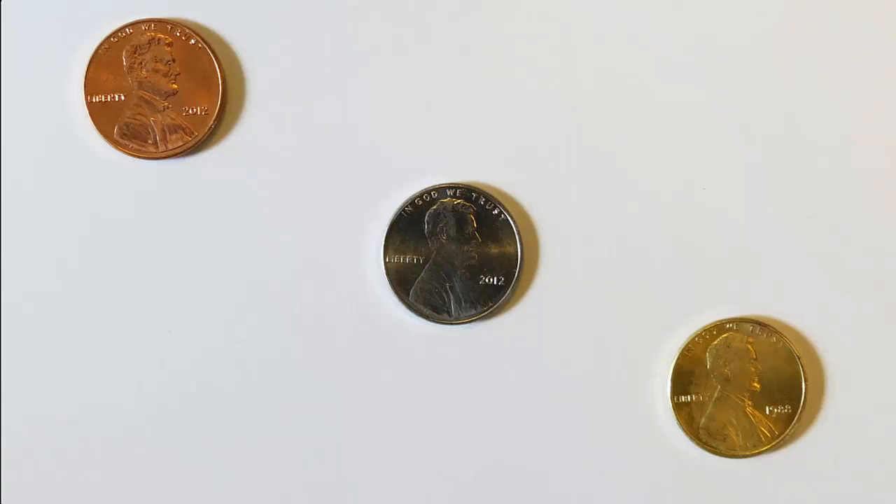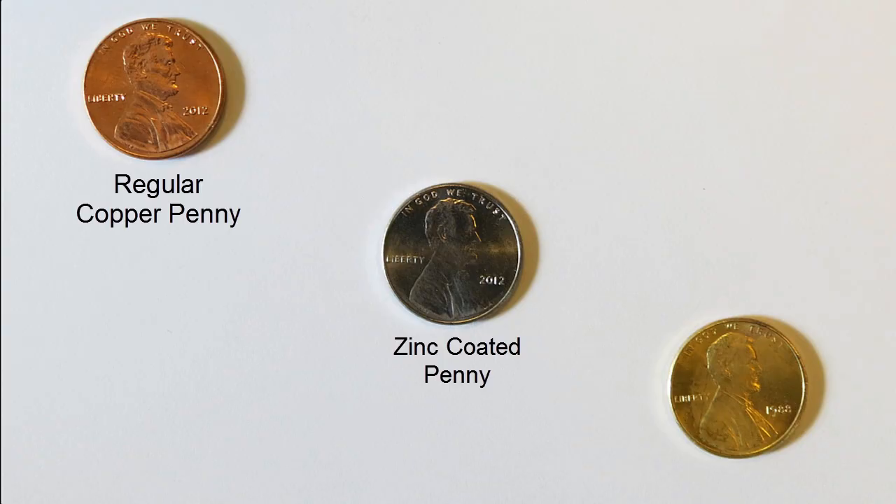With a little bit of chemistry, we can take a copper penny, coat it in zinc metal, and then melt the copper and the zinc together to produce what looks like a gold penny. So let's see how we do that.